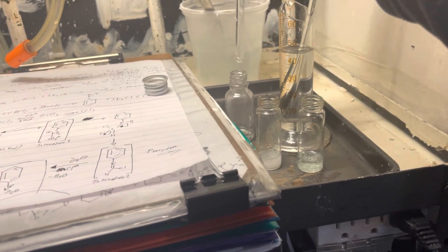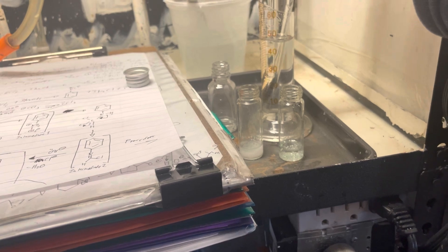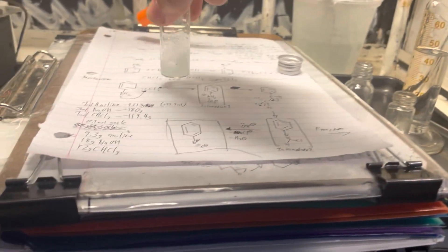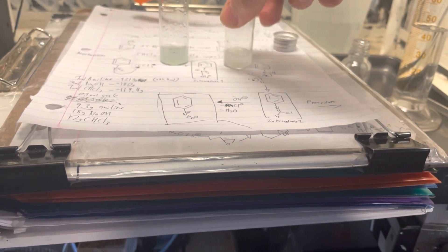I'll go into the mechanism a bit more in-depth later — me posting it on screen because I'm too lazy to explain it. So we're gonna dissolve all of this in ethanol, mix it together, and bring it up to a bit of heat, and we will be done with the synthesis.